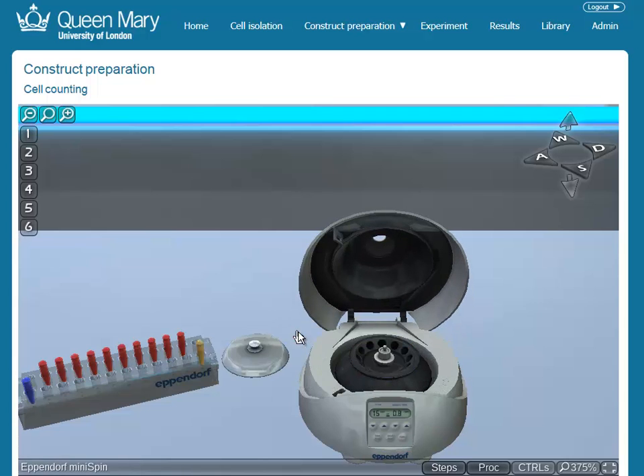Equipment can be set up so that constituent elements can be taken apart and put together, and animations are created to give positive feedback that things are working or to show what is going on.